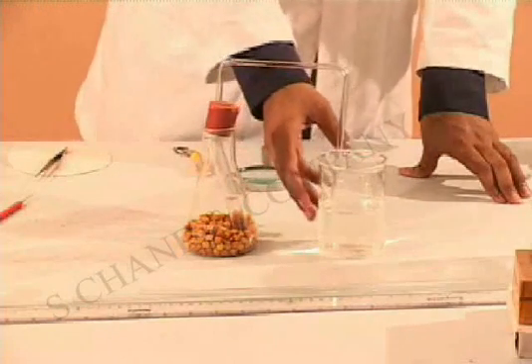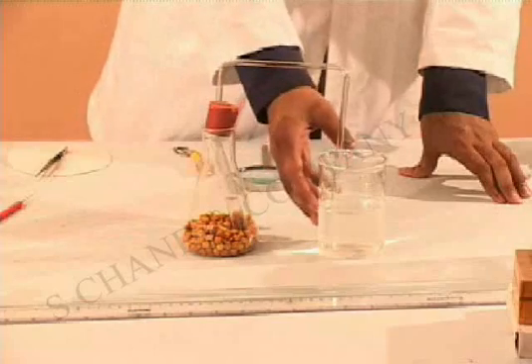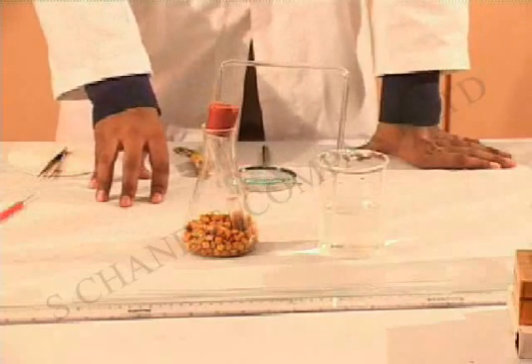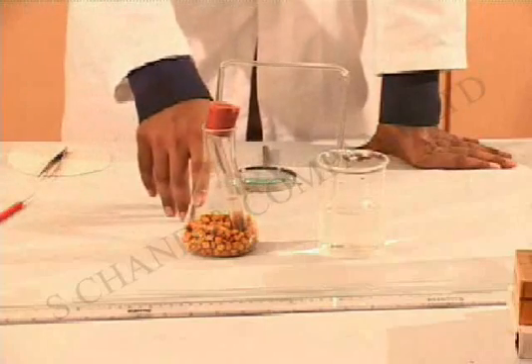There could also be a few bubbles that you can see coming through this water. The lime water in the test tube turns milky. This primarily happens because of the presence of carbon dioxide which is released as respiration is happening.